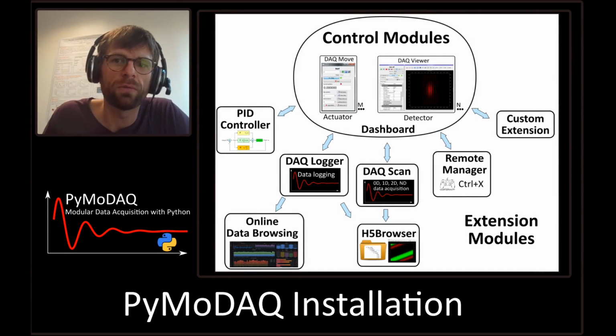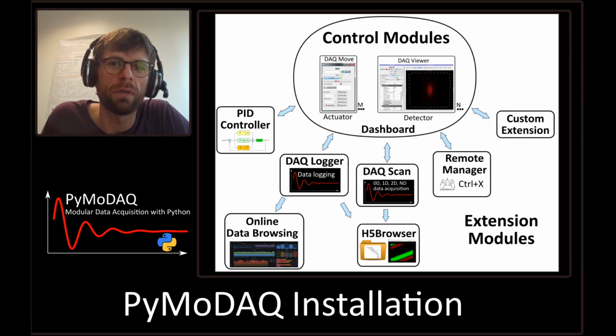Hello everyone, welcome to this video series on PyMoDAQ. Today I'm going to show you how to install PyMoDAQ from scratch and then how to use it.